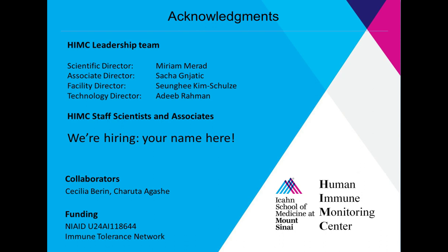Great, thank you. Your next question is, are there other ways to store antibody panels, for example, freezing? Absolutely. This is a nice technique that was published again by Hendrik Mai's group, essentially taking an antibody panel and sticking it at -80 degrees, which does a very effective job of preserving many of these antibodies for long-term storage. I should note that conventional 4-degree storage does not work well for mass cytometry panels. We see all sorts of strange data artifacts that happen when a panel sits around. But freezing it does seem to be quite effective, and I think is a more accessible workflow for many labs that don't want to embark on lyophilization.